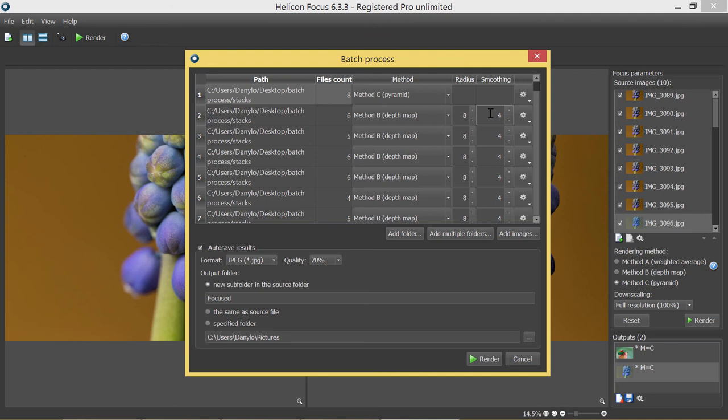Once you press the render button, the batch process window will disappear and you will see all of the stacking results in the output window in the right-hand bottom corner and they will be automatically saved to the target folder.